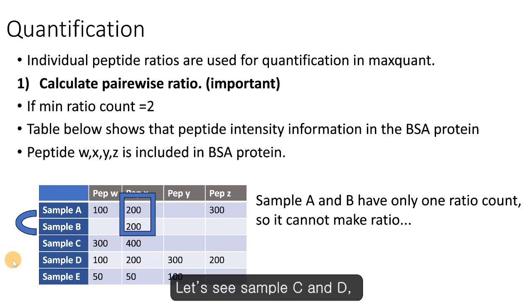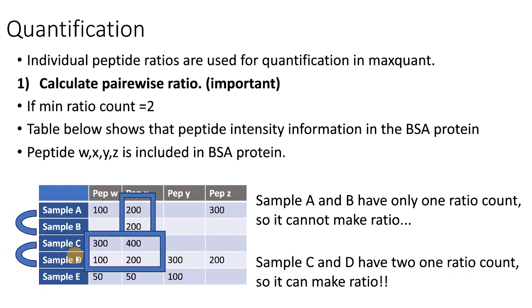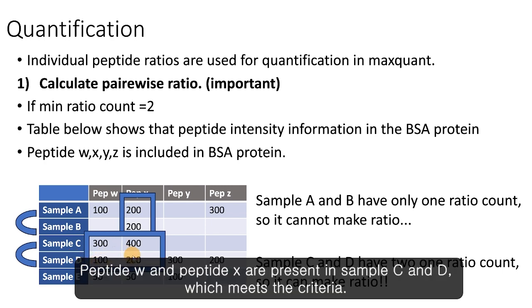Let's see sample C and D. Peptide W and peptide X are present in sample C and D, which meet the criteria.